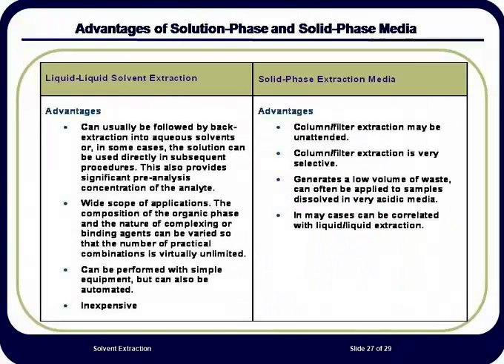The table here shows the advantages of both types of chemical separations. It is important to note that these are generalizations, and in specific instances you may have different types of advantages.